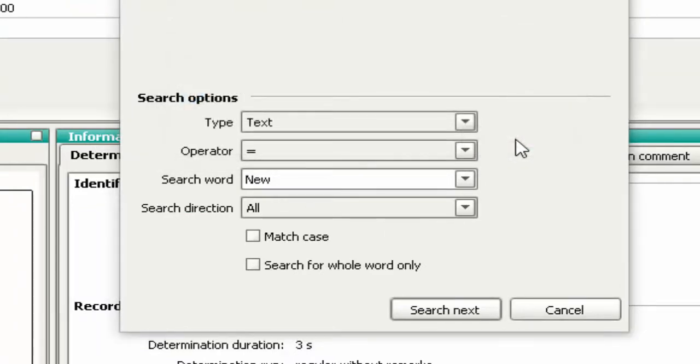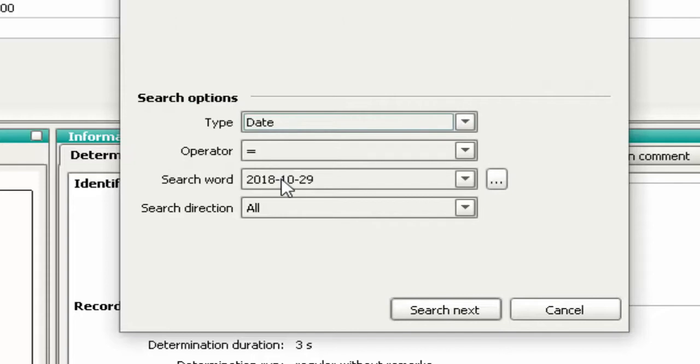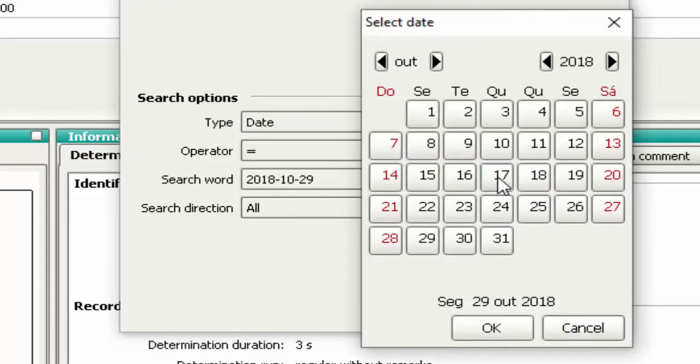Now let's look up a date. Select Date, click the Ellipsis button next to Search Word. Choose the date you want and click OK.